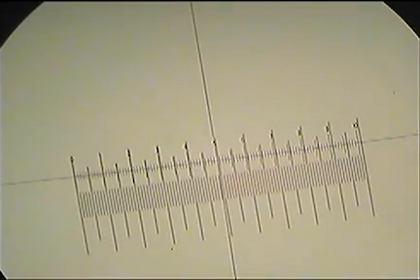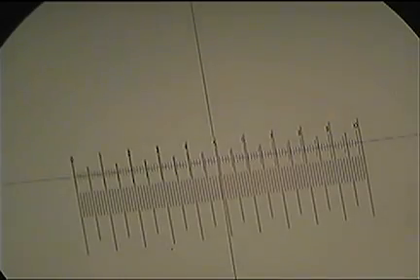Fantastic. So to work out what the size of each unit on the eyepiece is, we take the distance on the stage micrometer that we've measured, and we divide it by the number of units on the eyepiece graticule at that distance. So it was our 0.95 millimeters divided by 9.6.